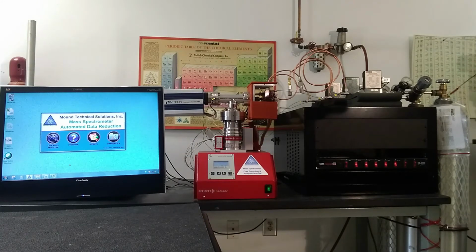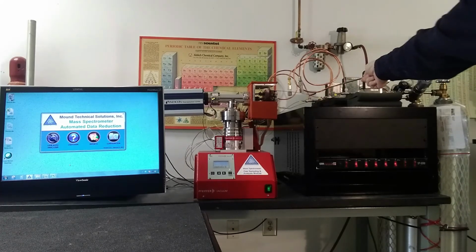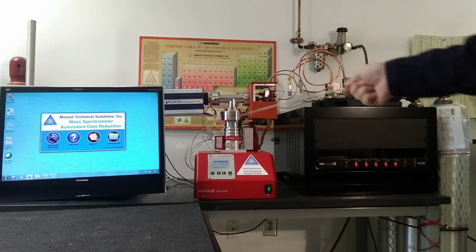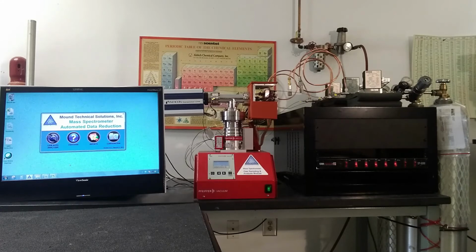So we've had our gas manufacturer supply us with 2%, 4%, and 6% oxygen and nitrogen gas cylinder standards. So these cylinders then supply 3 capillaries to our input, 2%, 4%, and 6% gases. And we have a 4th capillary out here in the room, which will bring in our 21% oxygen from room air into the mass spec. So this is the test configuration. Now let's move in and take a look at the test itself.